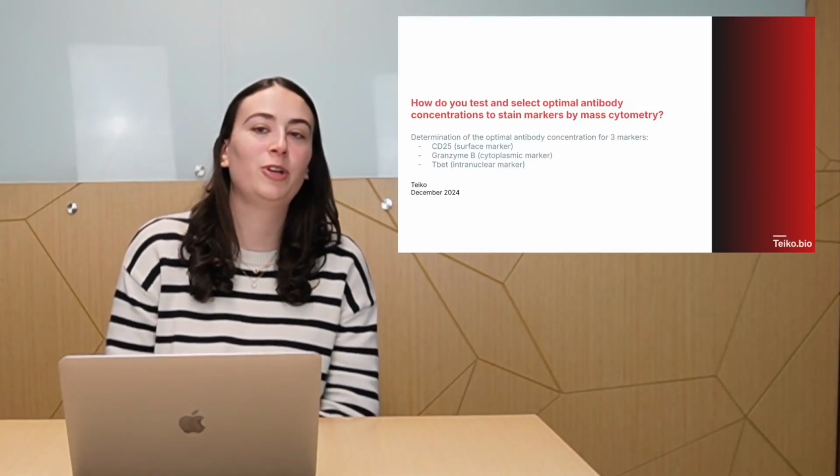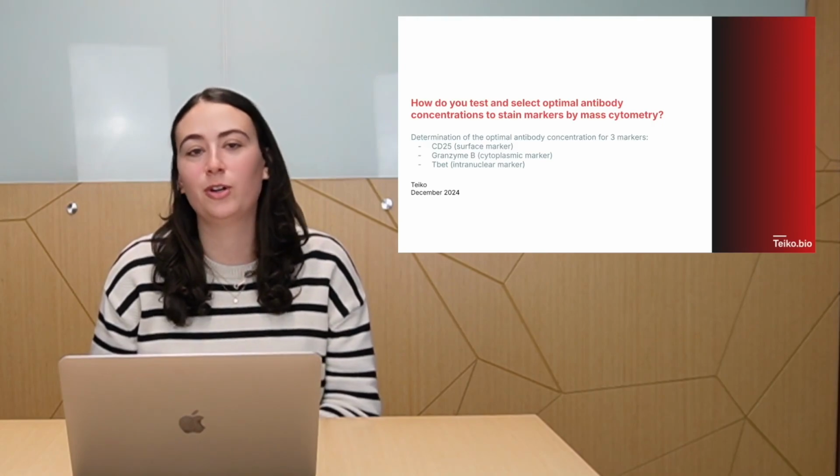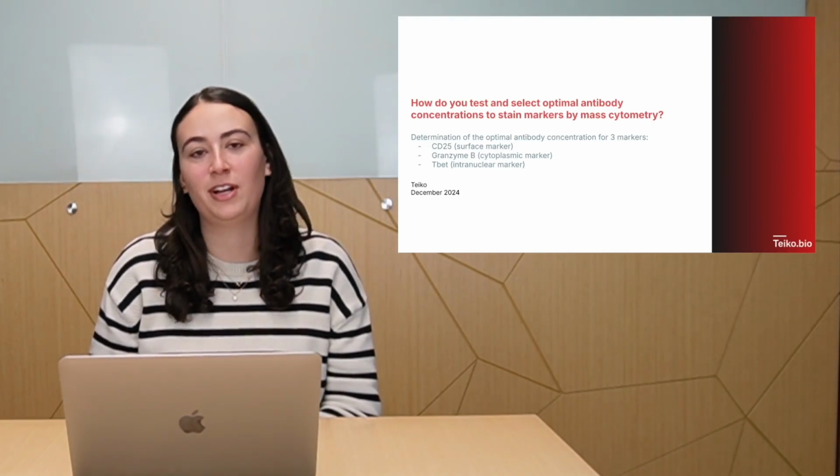In today's video, I'm going to walk you through how we test and select the optimal concentration that we use to stain markers on our mass cytometry panels. This ensures that we get an accurate signal for each antibody on our panel.